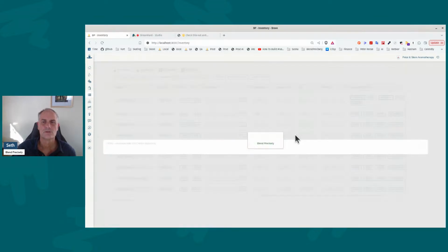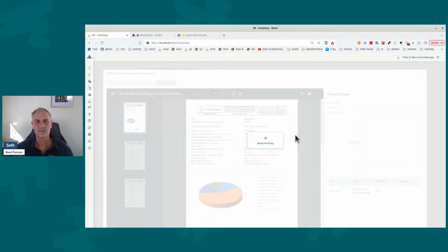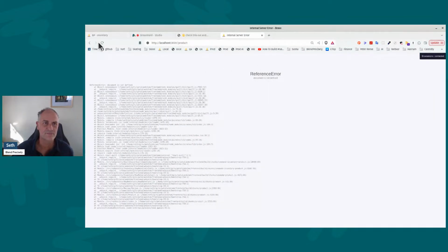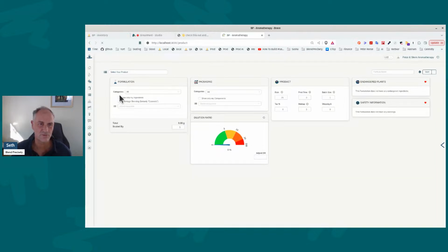And the first thing it does is it uploads it, and you'll notice that there's a new panel over to the right. This will take a little bit of time, but I'll come back to this when it's done. But for the moment, I'm going to swing on over into another window. You're looking at my top secret local environment, where sometimes things go awry, but not today.